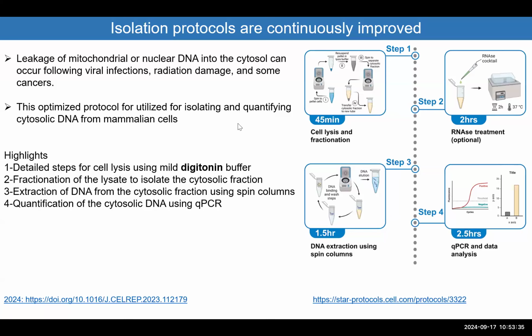So this protocol is made mainly to extract DNA from the cytosol, in conditions where you work with viruses, where you introduce the DNA into the cytosol. I'm not going to ask you about the details, but if somebody is interested to know more, this is one of the references you can check. So they are using a different lysis buffer. It contains digitonin, which will lyse the cells very softly.